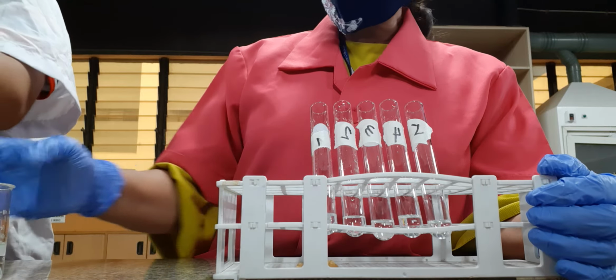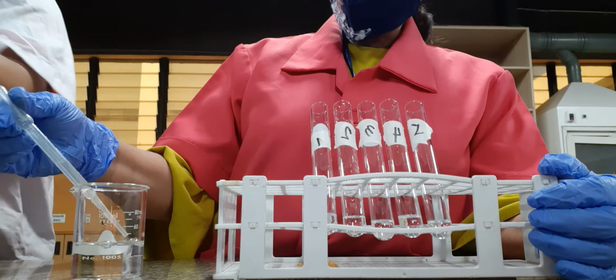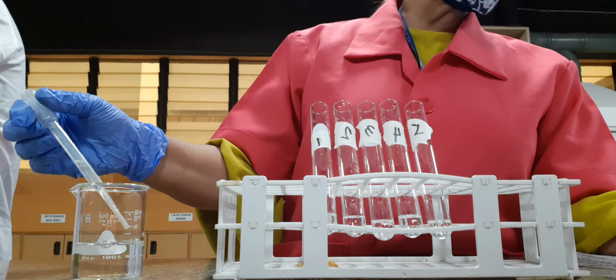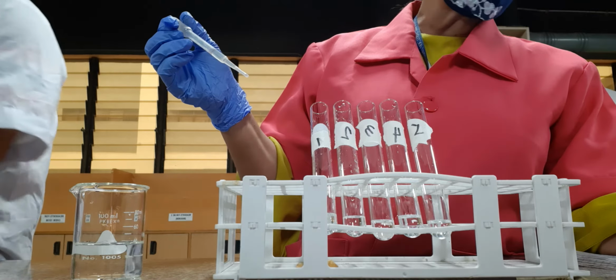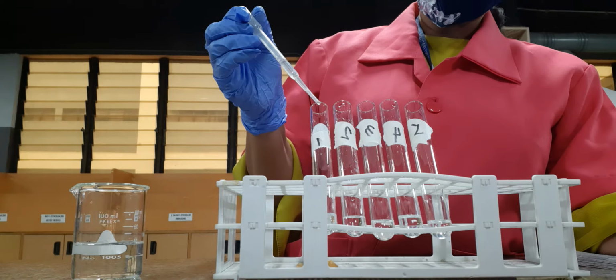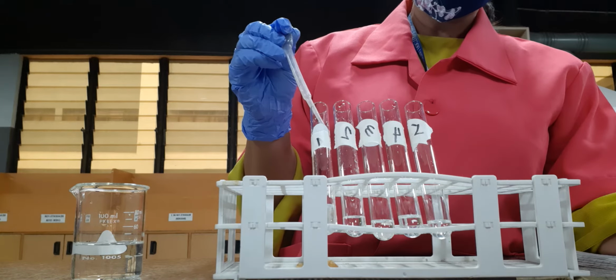Now I'm going to test these with the same volume of water. What you are going to do here is observe if we will be generating a colorless solution or whatever color will be developed. So we have here water and formaldehyde.